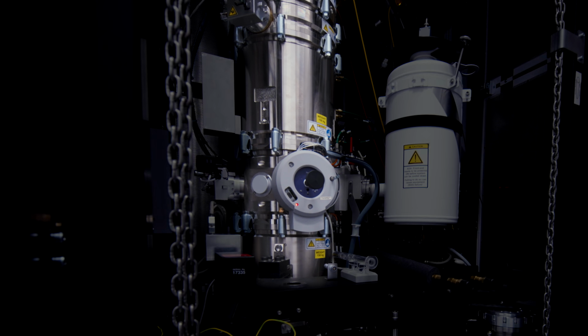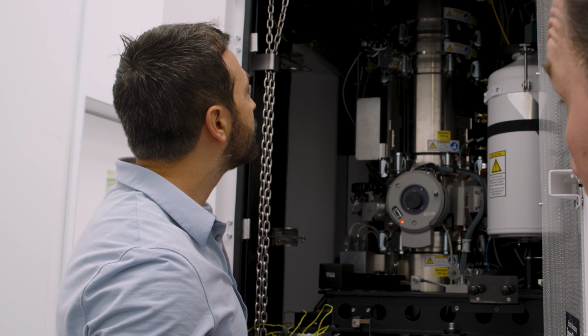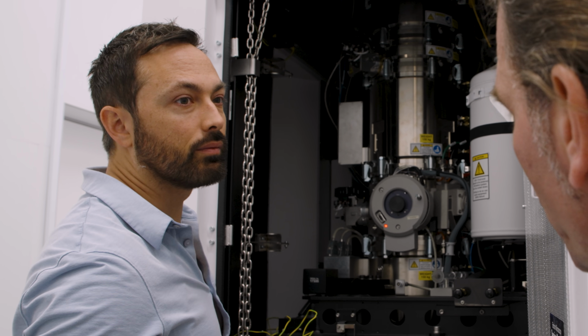So here what you actually see, that's the column of the microscope where we accelerate the 300 keV electrons down. 300 kilovolts, these electrons. Yes. So they are relativistic particles. How fast are they moving? 99% the speed of light, or? Well, around 80% the speed of light.